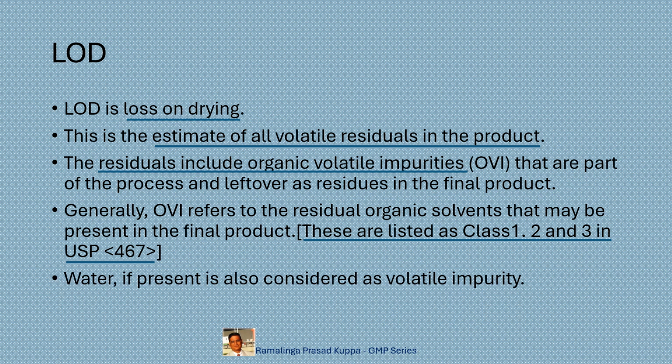Water, if present, also is considered as a volatile impurity. So, if water is present, generally the LOD test will be done at 105 degrees Celsius because the boiling point of water is 100 degrees Celsius.